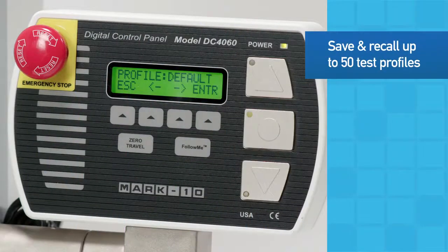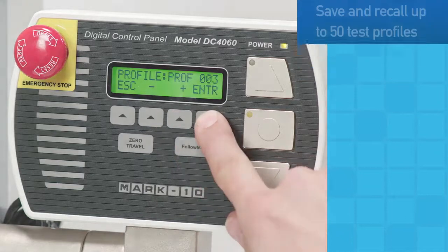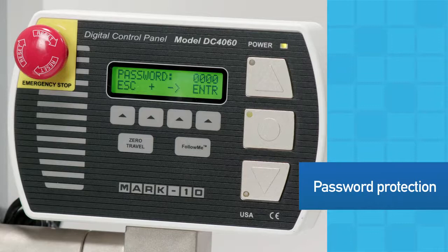Save and recall up to 50 test profiles to accommodate a variety of test methods. Password protect the menu to prevent unauthorized changes.